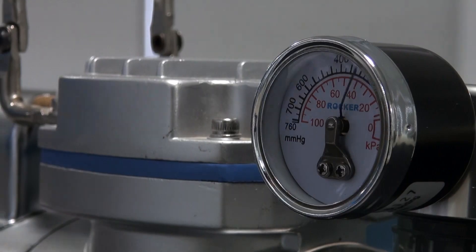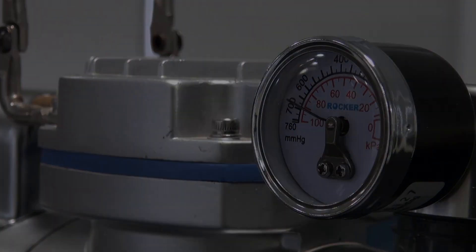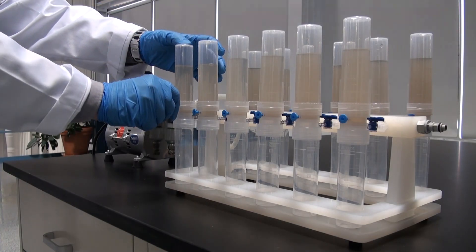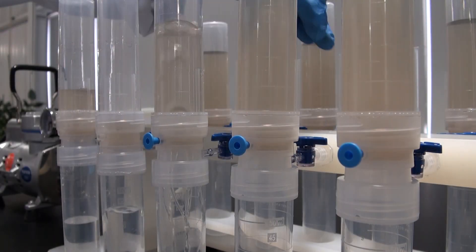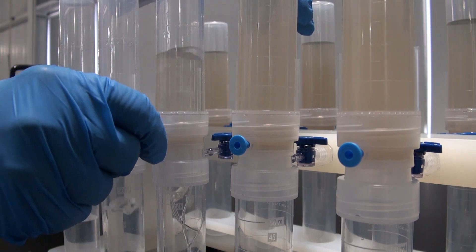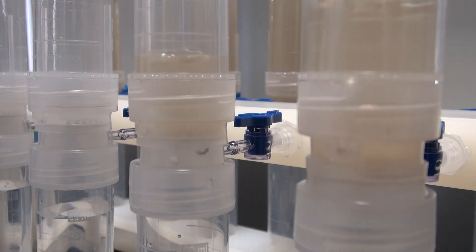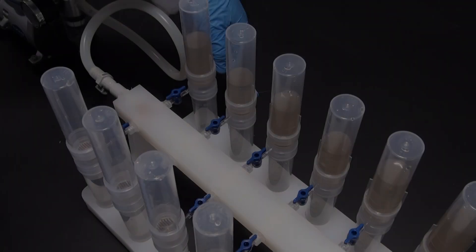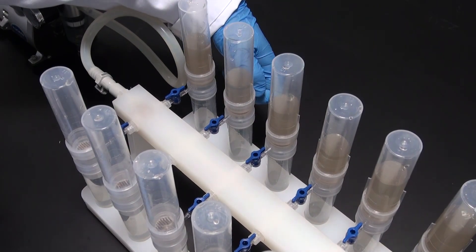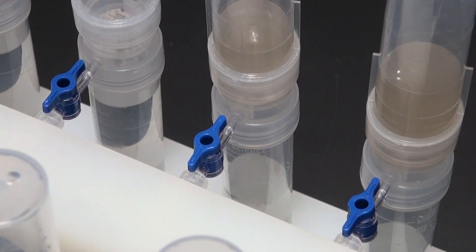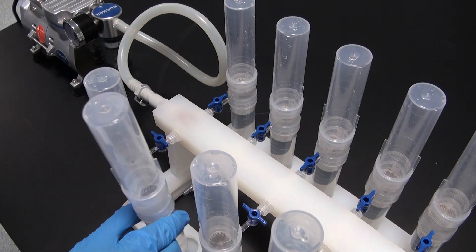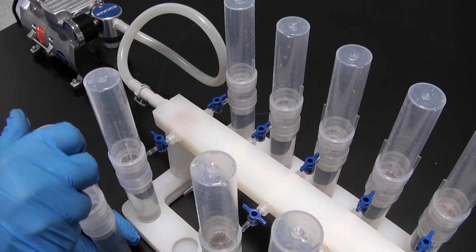The vacuum pump creates suction within the assembly to quickly filter particulates from the samples. Digifilters are available in 0.45 µm and 1 µm hydrophilic Teflon membranes, as well as 0.45 µm Metricel membranes and 0.7 µm glass membranes for TCLP filtration.